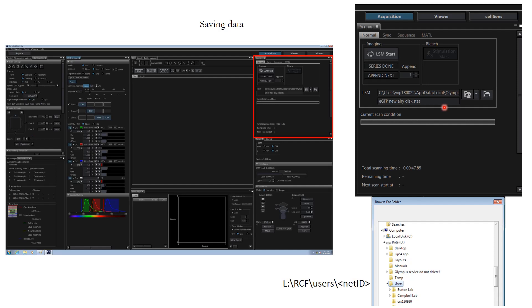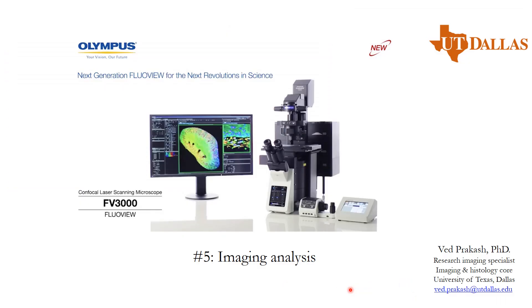Once your imaging is done, make sure that you cut your folder out of this folder system and put it on the departmental L drive in RCF users under your net ID folder so that you can take the images with yourself. The transfer speed of this data is about 10 mbps, so accordingly calculate how much time it is going to take you. For example, for 20 GB data it will take 30 minutes. Plan accordingly and use of pen drive or hard disk is discouraged because it sometimes is the cause of corruption of the software. With that we come to the end of module number four. We'll see you in module number five where we'll be doing some basic image analysis.